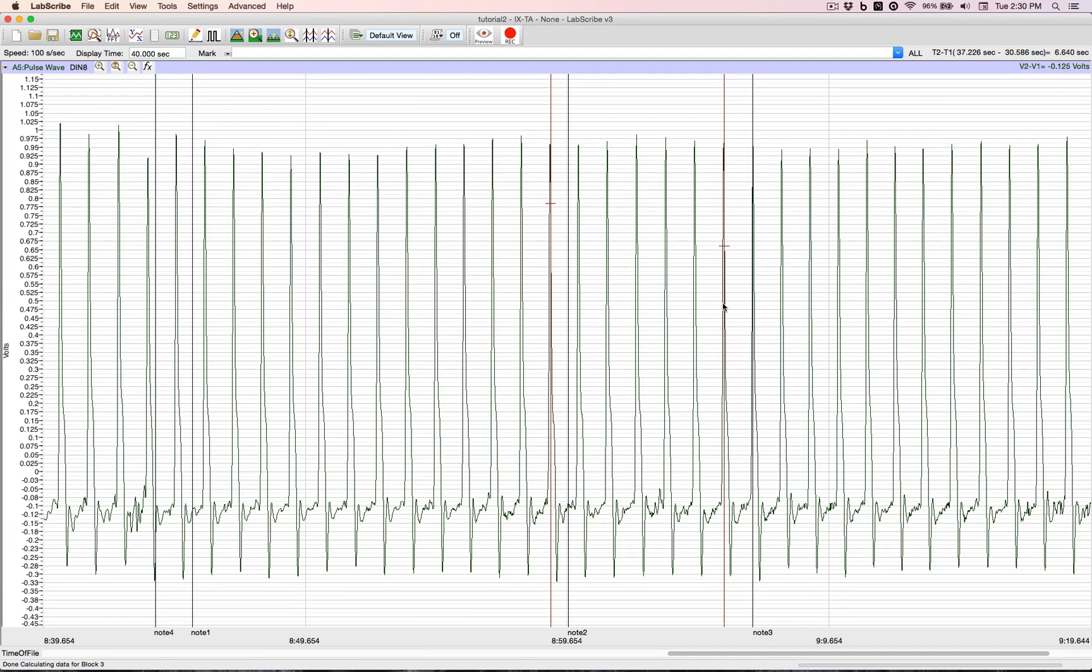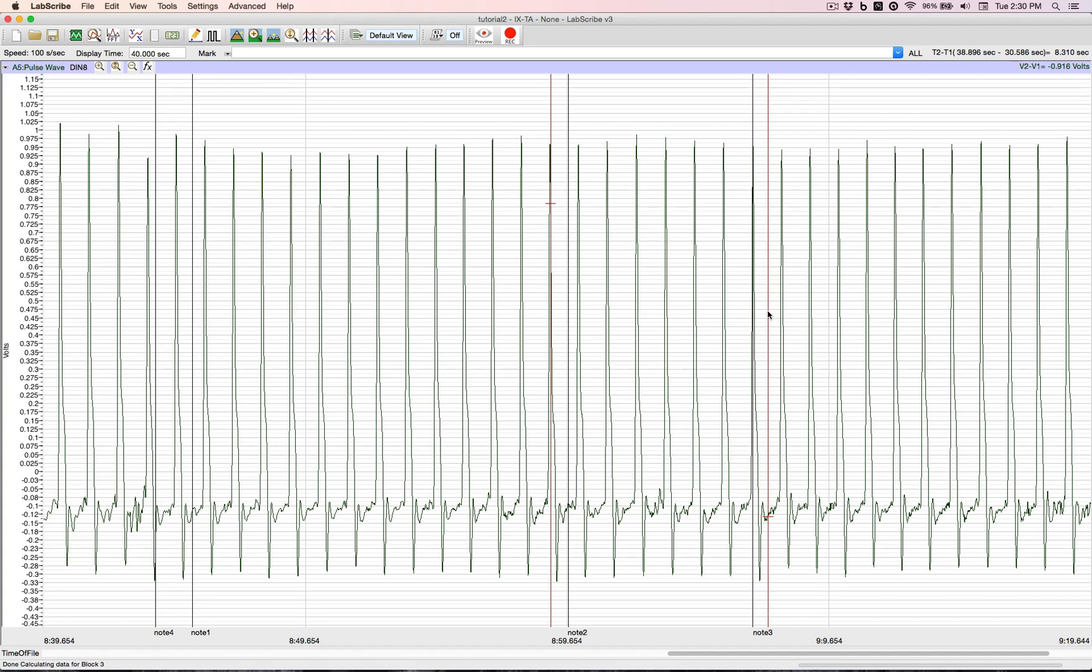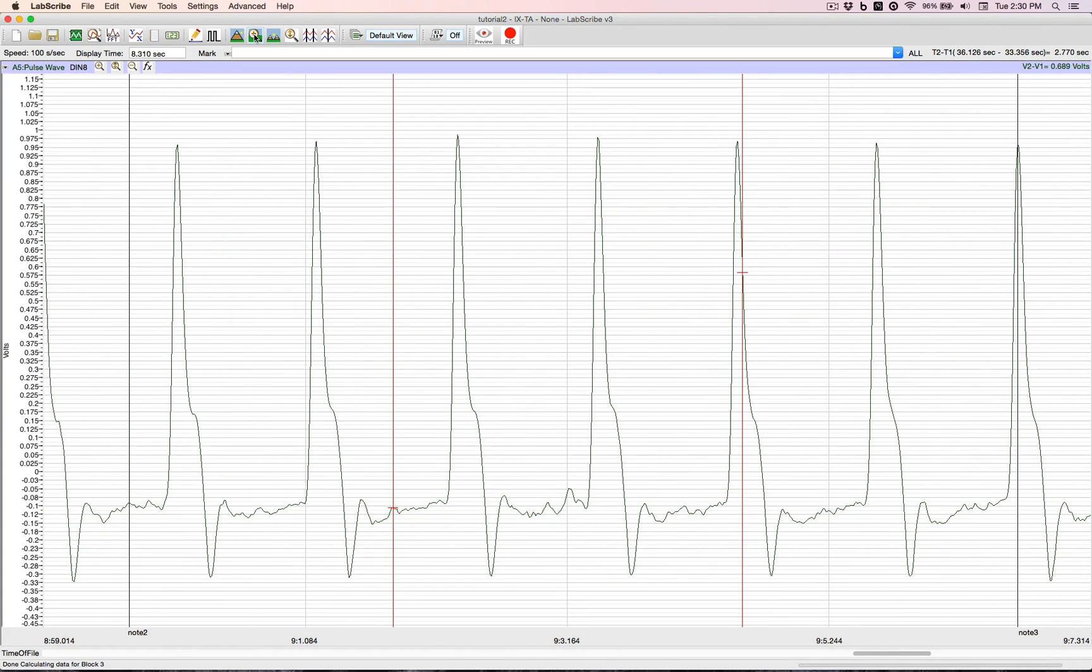There's one. There's the other. We click on zoom between cursors. And we've now zoomed in on that area.